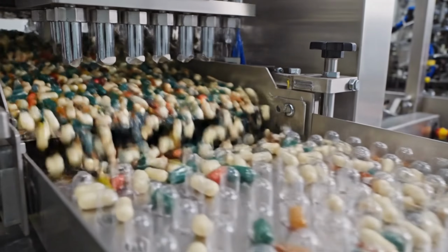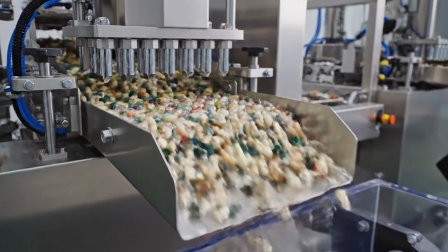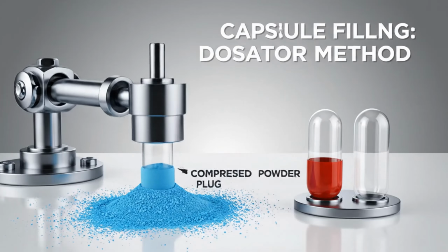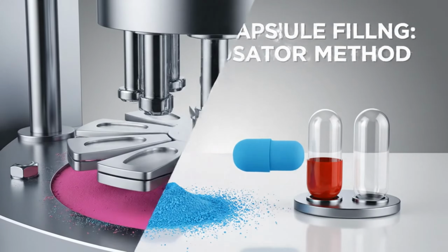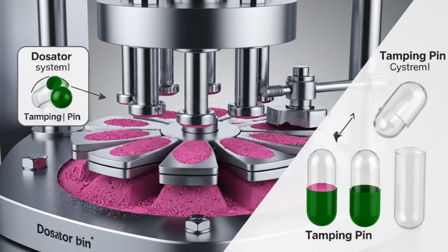If the cap and body do not fit together with the correct locking force, the capsule fails. The capsule filling machine separates each empty shell into its 2 components using vacuum suction. There are 2 principal filling mechanisms. The dosator method uses a hollow tube that picks up a compressed powder plug directly from a.